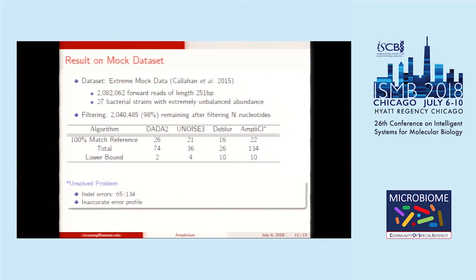So I don't want to talk about the false positives. Let's just focus on the first nine, which is the number of sequences that 100% match the reference. Our algorithm can find more haplotypes than the other method and go deeper. And for the other one, I actually find more, but the four more haplotypes that it found are below our threshold.